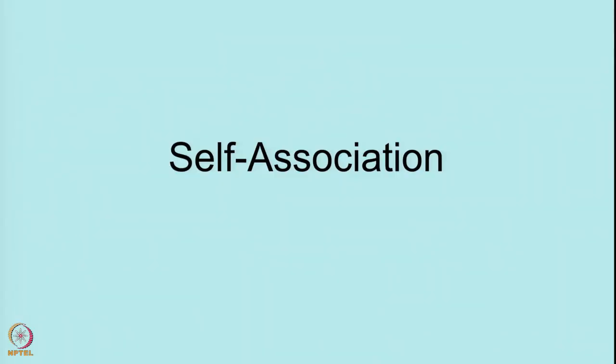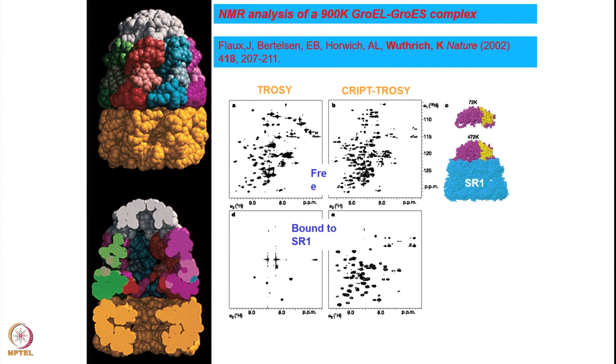In the previous case, what we saw was that the associated state is particularly known, the structure is known, how the association is happening is already known in these cases, okay. So we know the structure, therefore we know the pattern of association of the individual molecule. The structure is not changing from individual molecules to the associated state, because the spectral peaks have the same pattern there, and this is to demonstrate that you can actually see the signals even in large ensembles, okay.